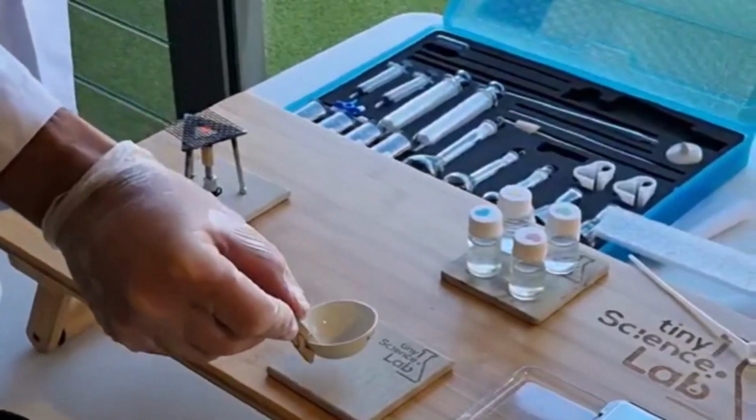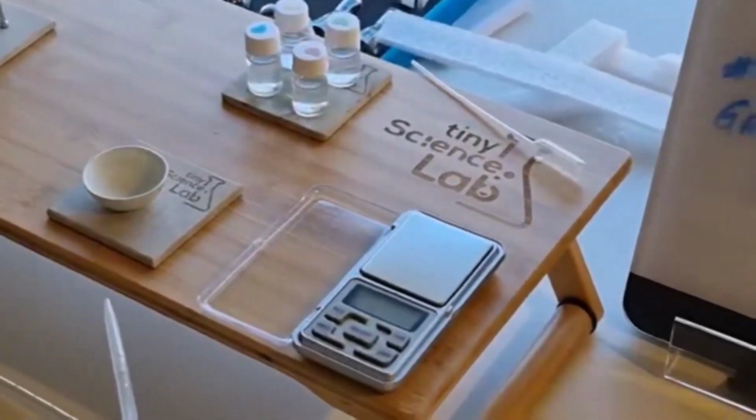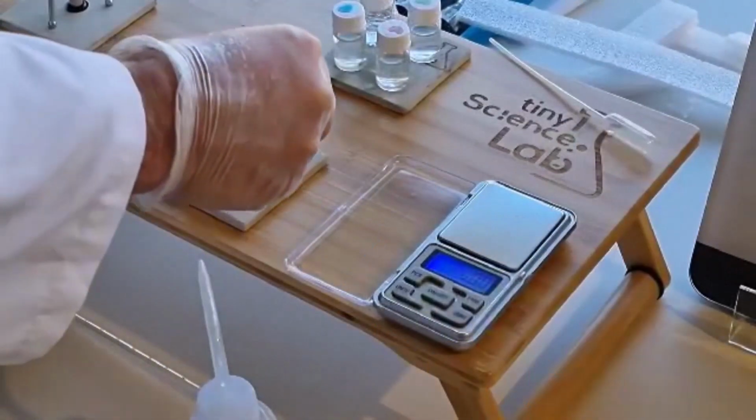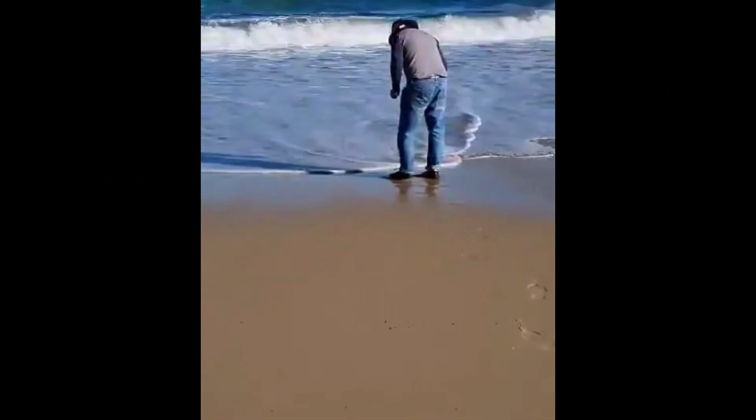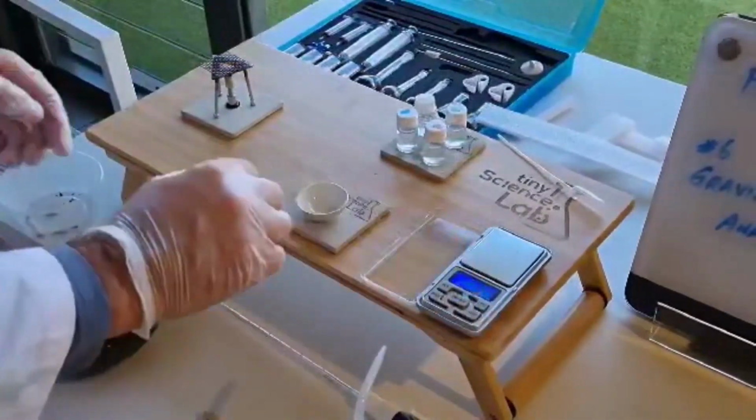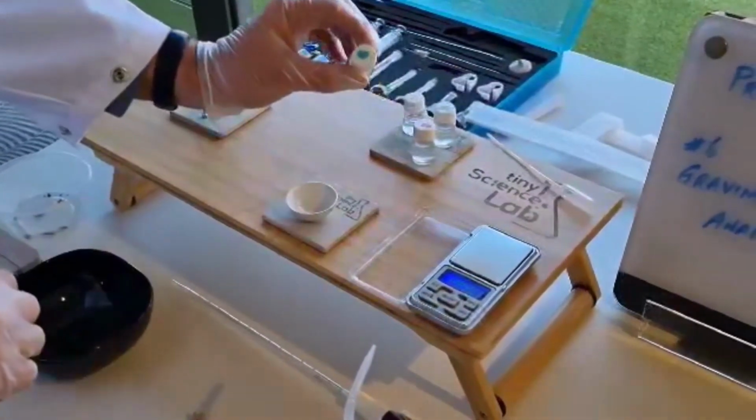So Fingal's now done. So let's just give that a second to cool and then we'll weigh that one as well. Let's weigh Fingal. Okay, 10.95. Let's get our sample from Kingsley Beach. All right, so we're ready for beach number 3. That's Kingsley Beach, and that is the blue color.